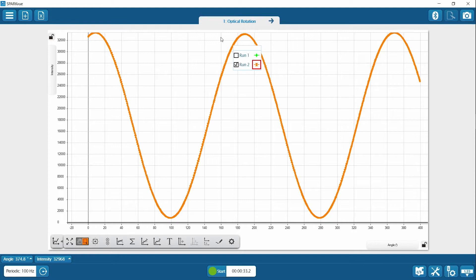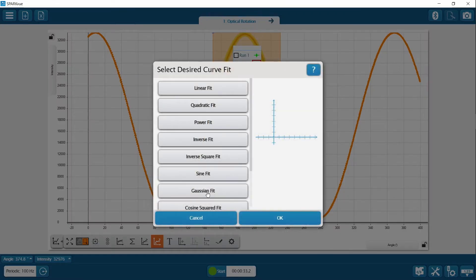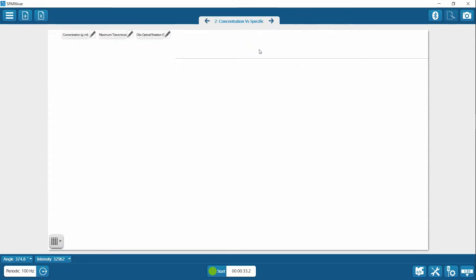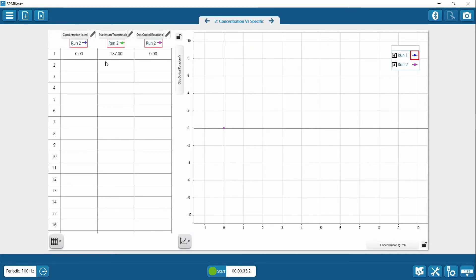Go ahead and stop, and let's figure out where that peak is here on this run two. Using the select tool, I'm going to get a nice symmetric amount of that peak. If you think you missed it, maybe move it so that you get the whole peak like I just did. I grabbed the whole box and moved it. Let's put the Gaussian fit on here and say okay. And this one now has a peak at 189. The C term in the Gaussian fit shows the center of distribution.